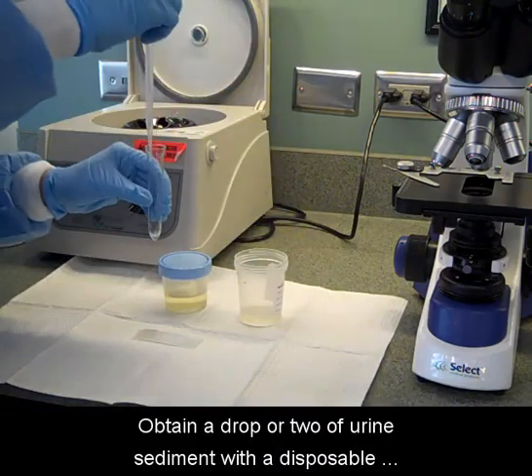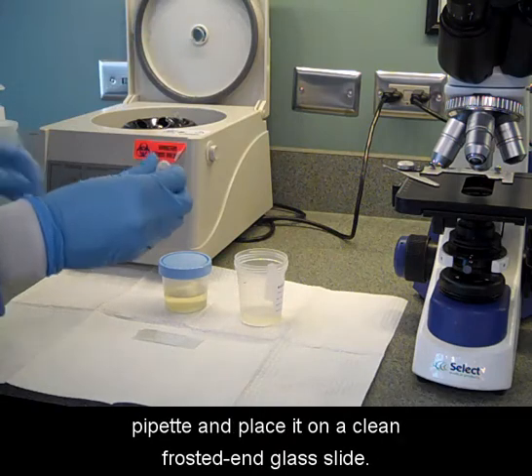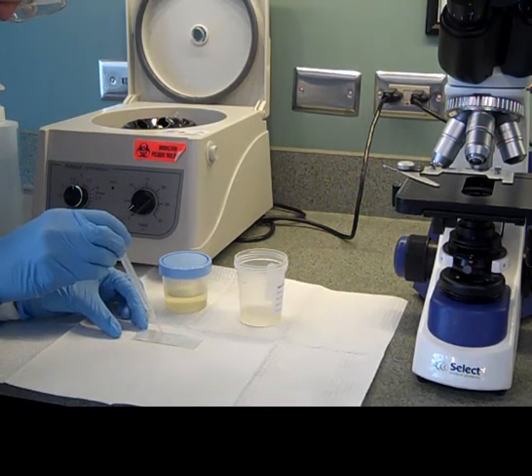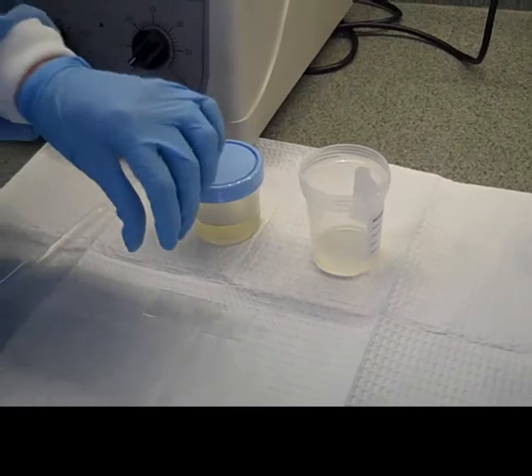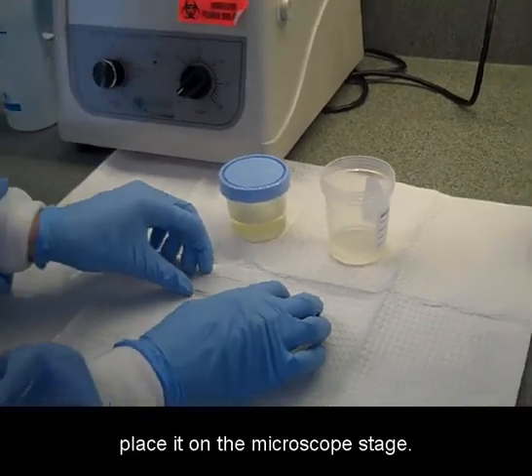Obtain a drop or two of urine sediment with a disposable pipette and place it on a clean frosted end glass slide. Place a cover slip over the specimen, allow it to settle, and place it on the microscope stage.